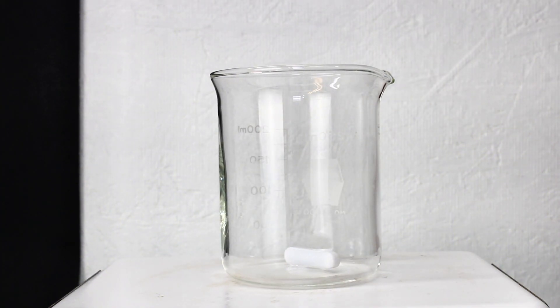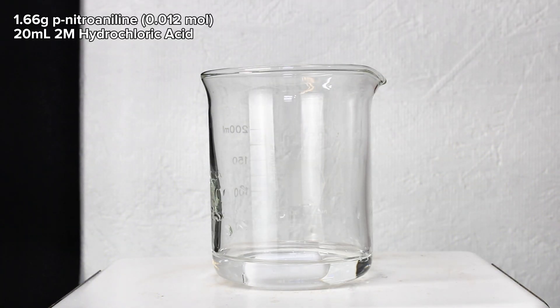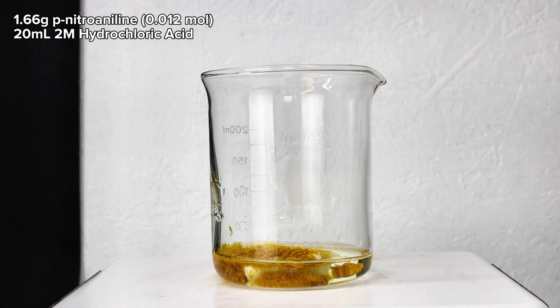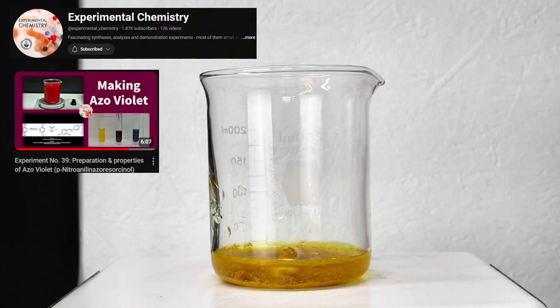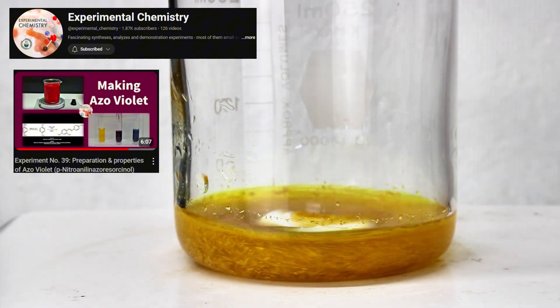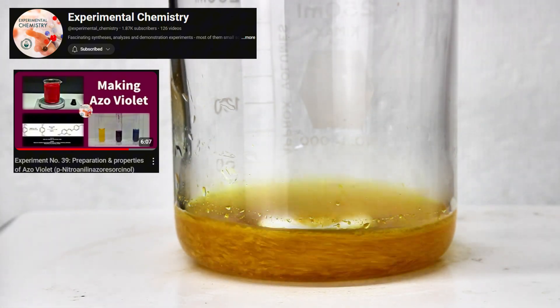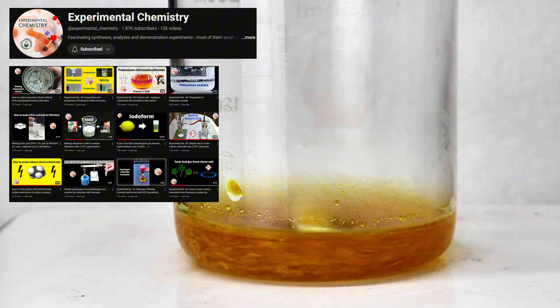To get started on making Azo Violet, the first thing I needed to do was to dissolve 1.66 grams of para-nitroaniline in 20 milliliters of 2 molar hydrochloric acid. This synthesis procedure is a slight modification of a procedure from Experimental Chemistry, who, as far as I know, is the first one to demonstrate this procedure on YouTube. He's got a lot of other cool videos like this one, which I'd highly recommend giving a watch if you're interested.